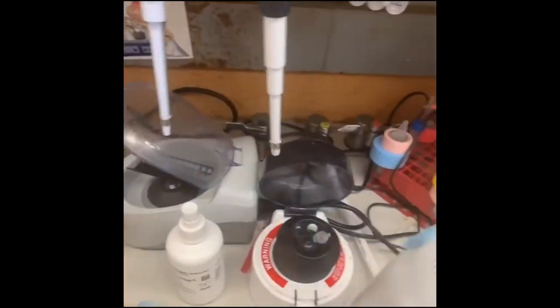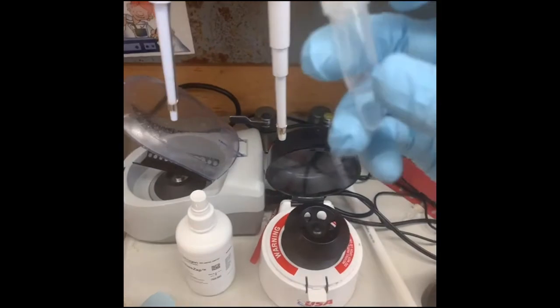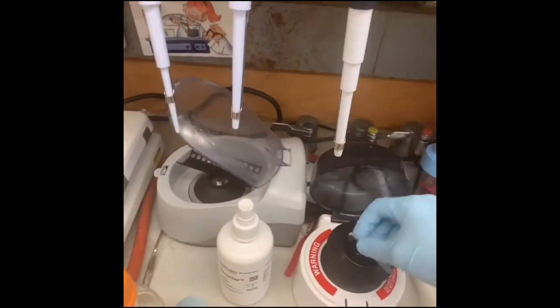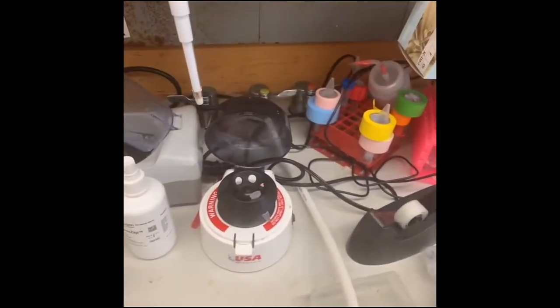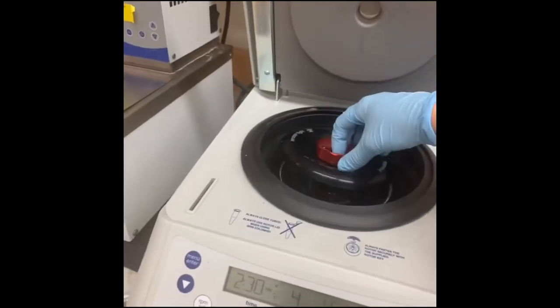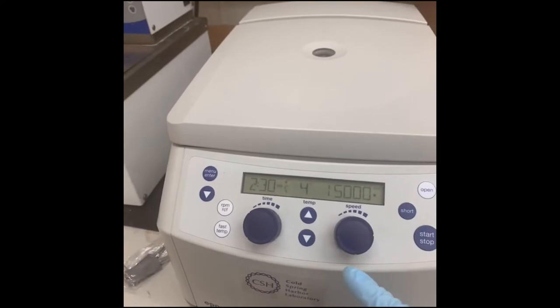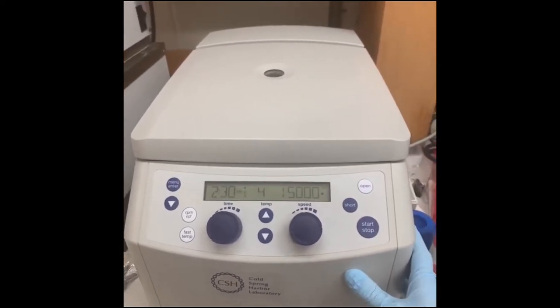We have these little pulse spin centrifuges. Centrifuges are another super important thing — basically something that spins really fast. The conical bottom comes in handy because you can pellet things out so they stick to the very bottom and you can suck out the liquid from above. This is a pulse centrifuge — a little benchtop one you use when you want to spin things really quickly. But if you want to spin things more controlledly, for a longer time and faster, you have benchtop centrifuges like this. The tubes go in there, you can set how fast and how long, and this one actually has refrigeration too, though not all centrifuges do.